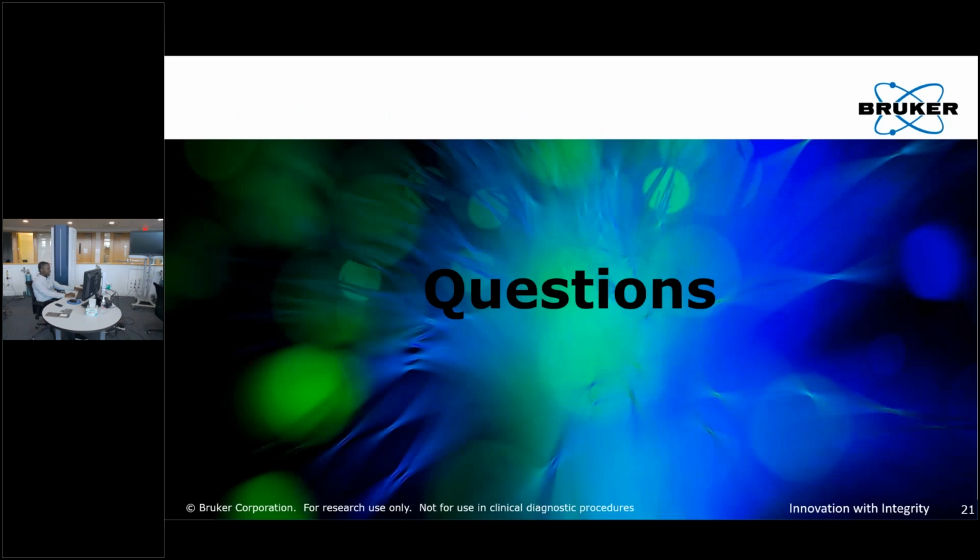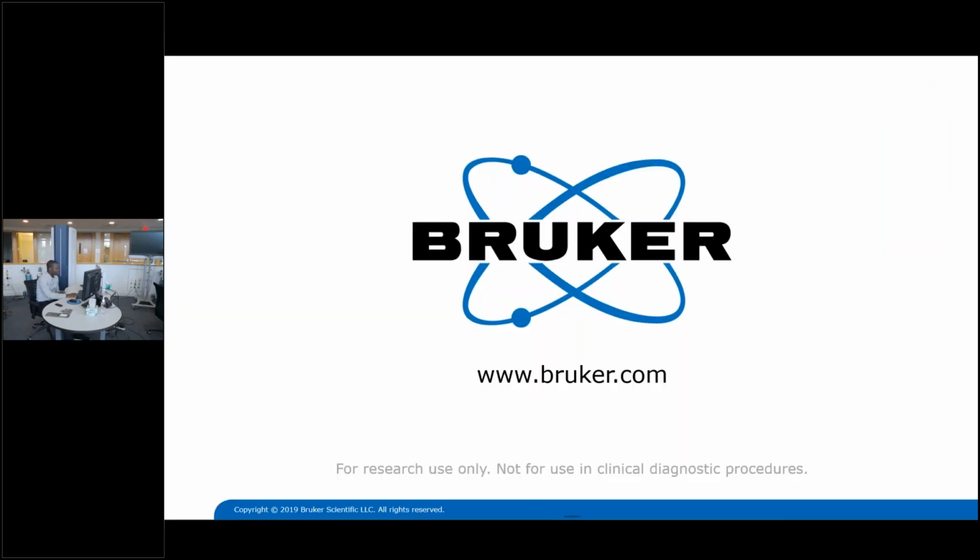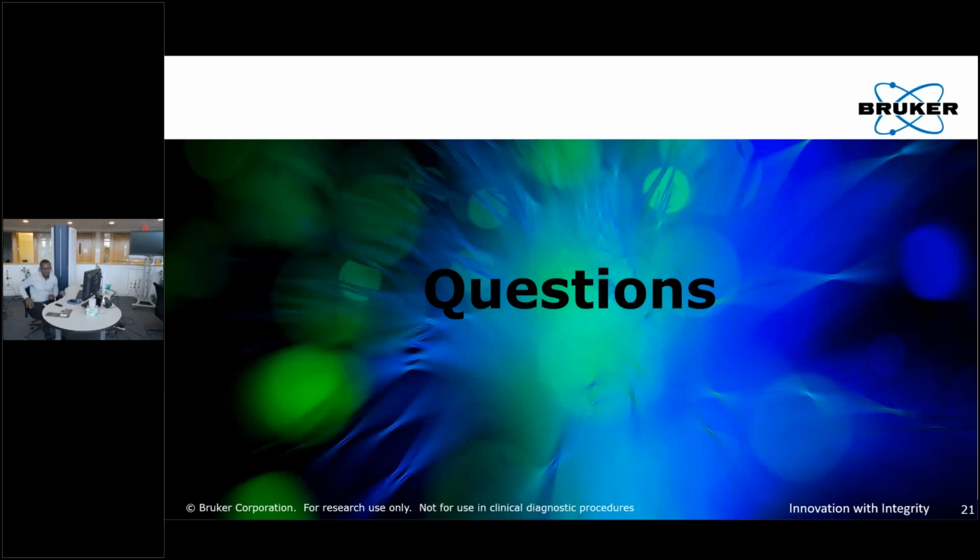And with that, I'd like to thank you for your attention, and I'll take any questions for the time remaining. Thank you, Pierre, for this very informative demonstration. Very nicely done. Indeed, we have some time for questions, and we have received quite a few. We'll answer as many as we can in the remaining time, and the rest we'll make sure to answer in separate emails. So let's start with what we've got so far.